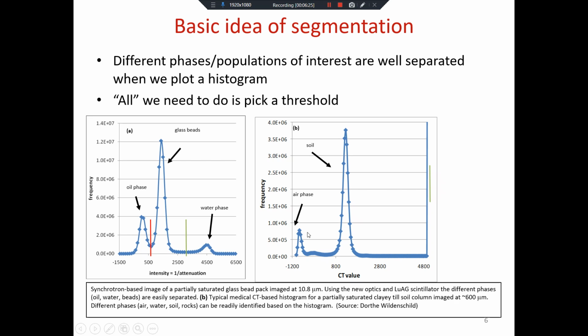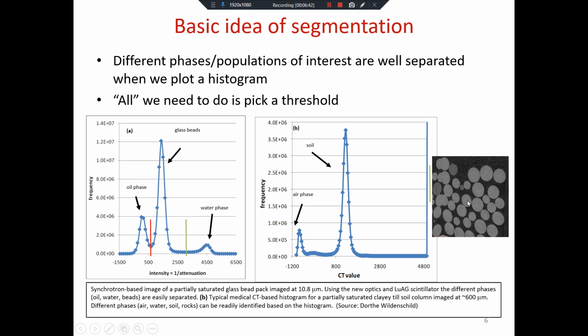And here, if I have air phase, it typically is very well distinguished from any other solid phase or liquid phase. So good separation on histogram basically also shows me that I have pretty good image. So this is an example image from here.